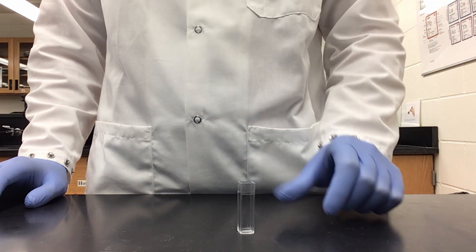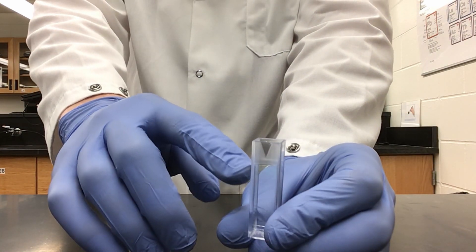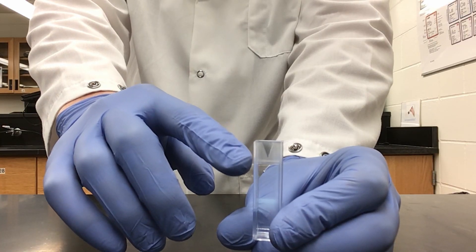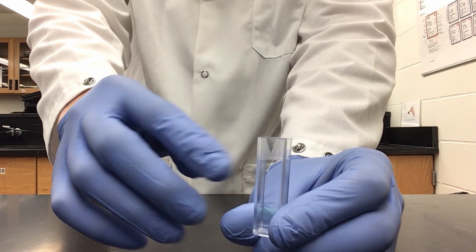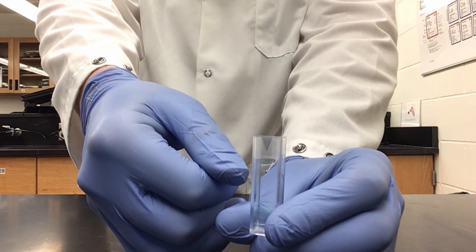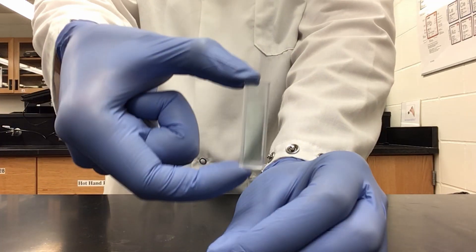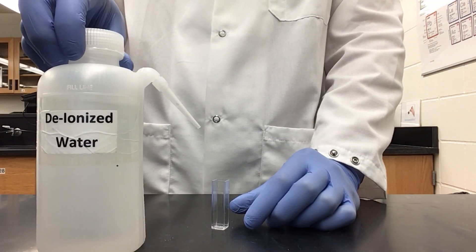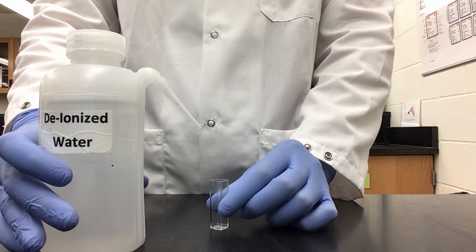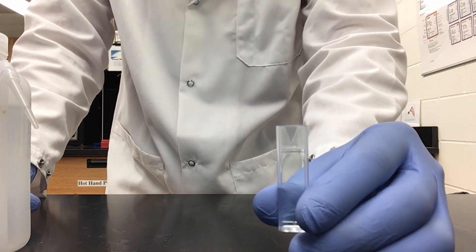Our first solution is going to be our blank. As you see our cuvette — it has a frosted, opaque portion up top, and there is a natural line that ends right there. When we fill our cuvettes, we want to fill to about that line or just slightly below, or in total about three quarters of the cuvette. For our blank, we are just going to be using deionized water. I have filled the cuvette to just below our line.